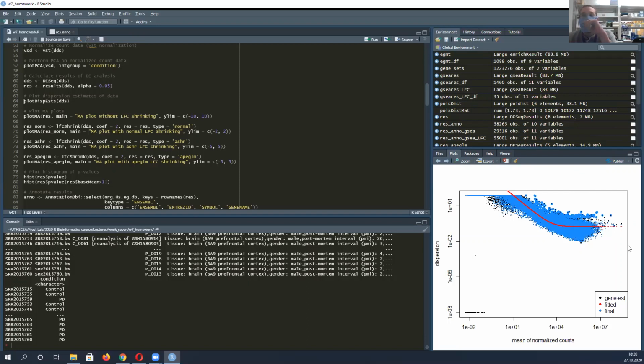Henry, you'll interrupt me if I'm saying something that's completely ridiculous, I hope. I mean, to be honest with you, I'm not even super familiar with how, I understand that they're trying to model the mean variance trend and then fit the data towards it, but beyond that I couldn't explain what they're really doing. Yeah, samesies. But it's a very pretty looking plot, so I did it. My takeaway from the DataCamp class was, if it looks sort of like this, you're fine. If there's weird stuff going on, like clouds of data just sitting in the middle of nowhere, there's probably something you should investigate.